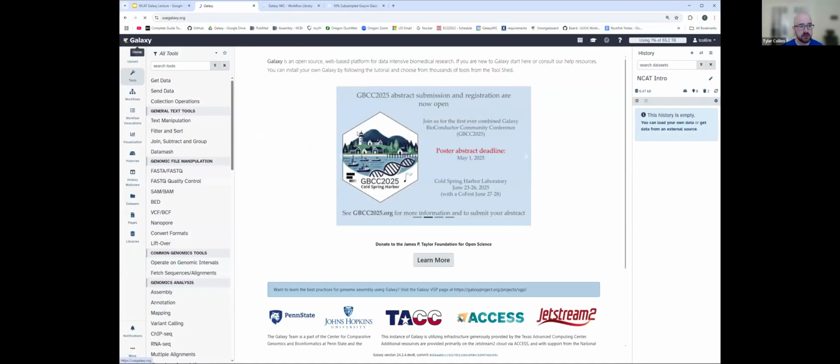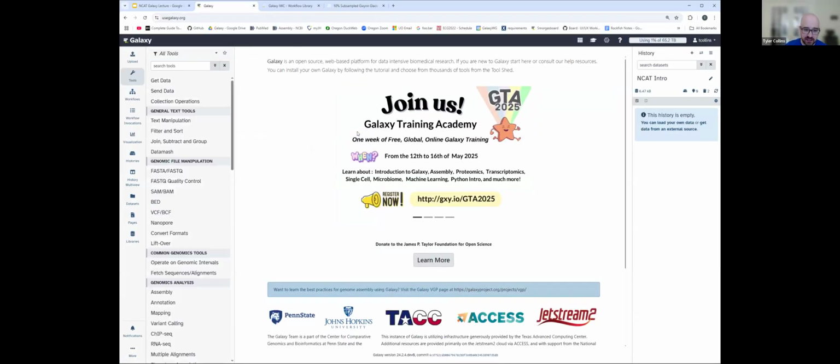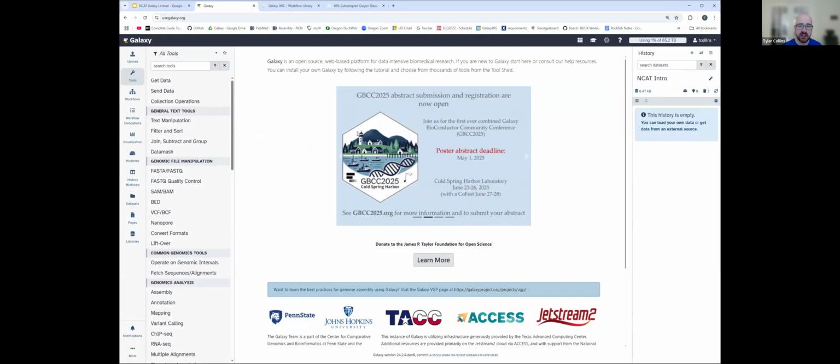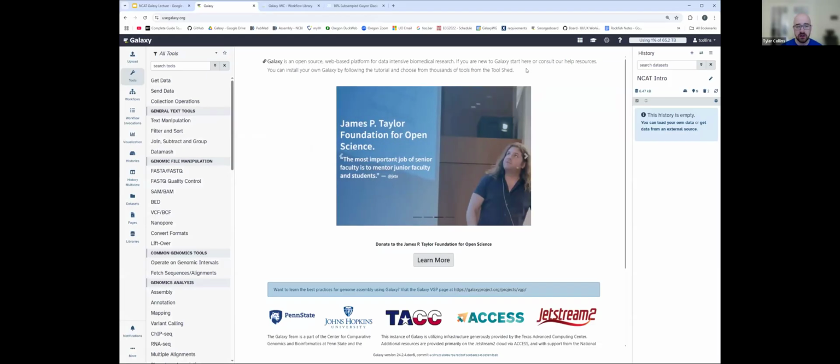All right, so welcome to Galaxy. This is your default landing page, what you're going to see whenever you log in when you enter the platform, and it consists of a couple of key parts that I'll go over.